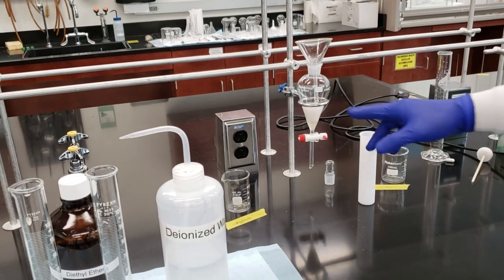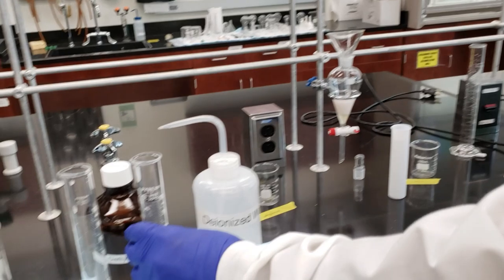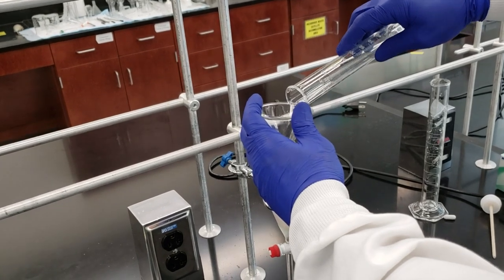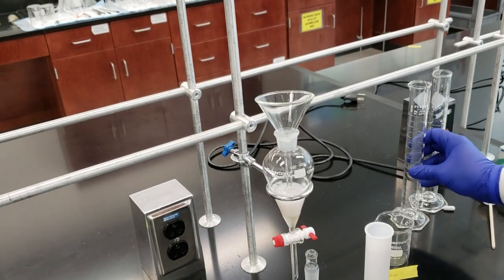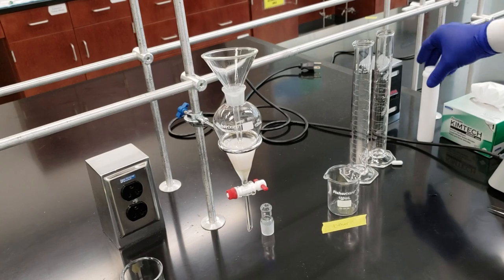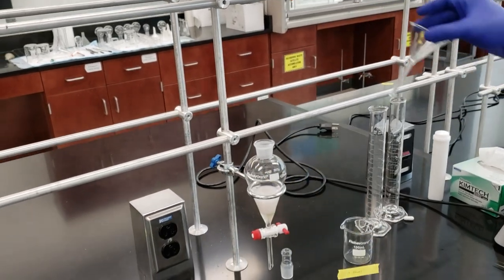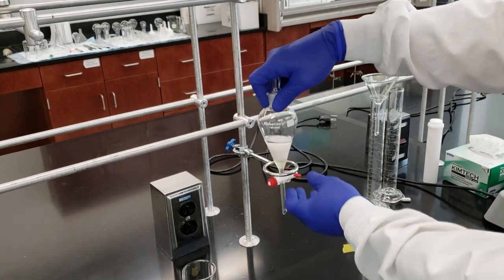Okay, so we have our original reaction fluid. We have 10 mils of deionized water. Now we're going to add in 10 milliliters of diethyl ether. I'll go ahead and cap my reaction vessel and set it aside here. Of course, we're doing all of this underneath the snorkel, as you can see. Let's take our short stem funnel out, set it to the side, and let's go ahead and extract.